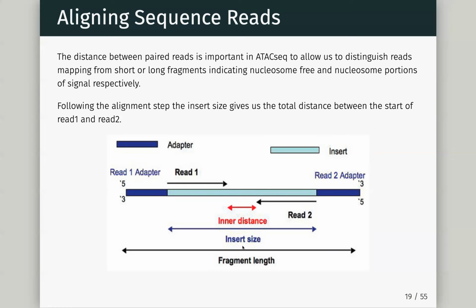Then we have what we would call the fragment size, which is often considered with the adapters. That's often what you'll see when they run a bioanalyzer or an electrophoresis gel. You'll get the size, and it will include the adapter. And then the actual thing we're sequencing is often the insert, and we'll refer to the size of that as the insert size. Cool.